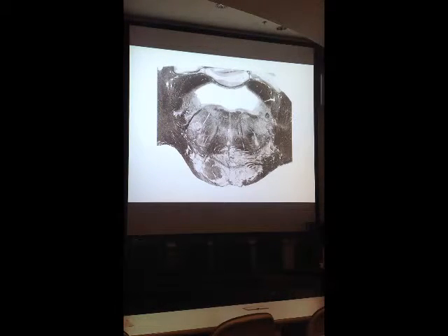Again, on this slide there's this other nucleus here. Can you name the nucleus that dominates this area? That's the facial motor nucleus. These are lower motor neurons whose axons, we said earlier, travel posteriorly and medially, and these are some of them right here. Then they curve over the top, traveling superficial to the abducens nucleus, and they come back out finally at the motor root of the seventh nerve. So these are lower motor neurons of the facial nerve that make up the facial motor nucleus, or you could call it the seventh motor nucleus as well.